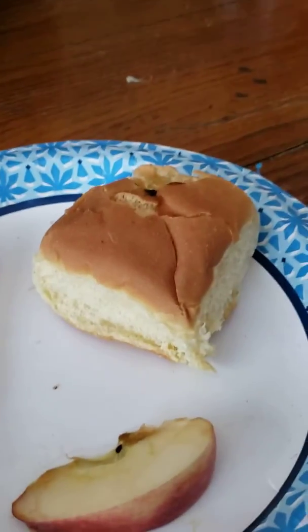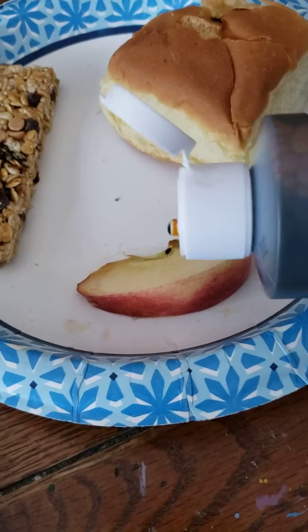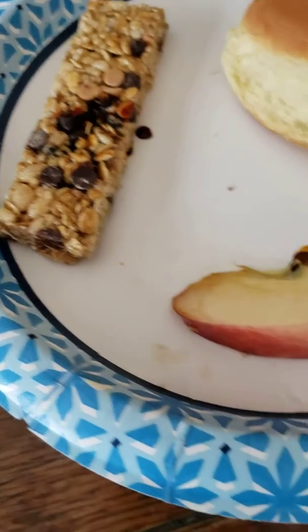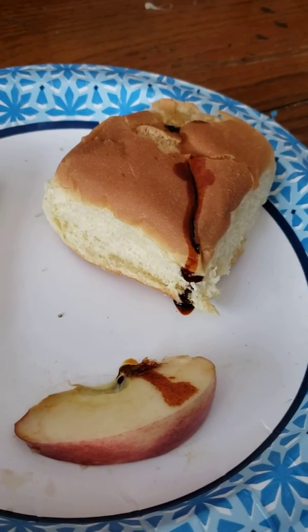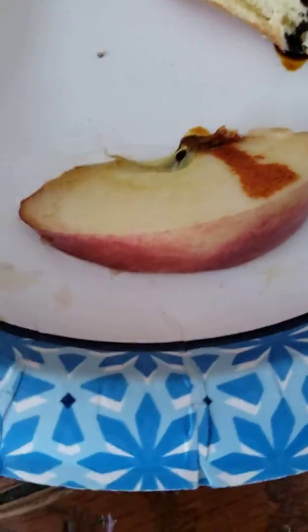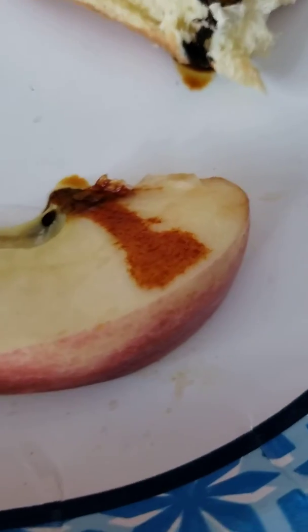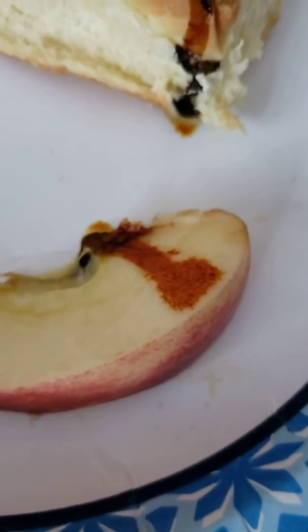Okay, so just gonna put a few drops. Okay, so the apple, it kind of stayed the same color, kind of a lighter color with a yellow tint to it. And the granola bar, well, that means this has no starch content since it stayed the same. It didn't really change colors.